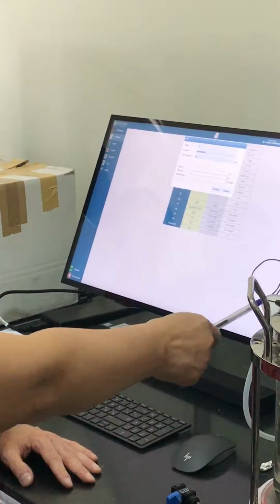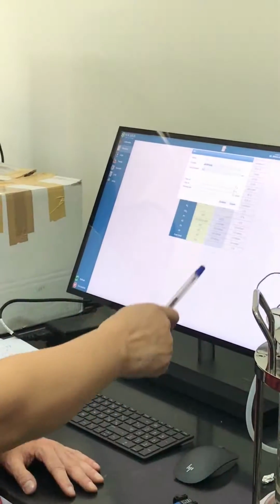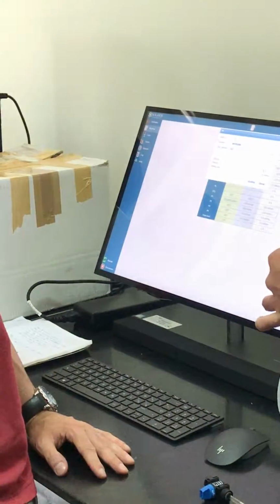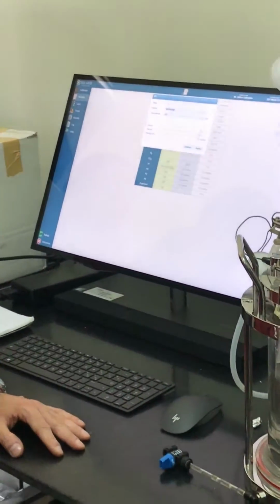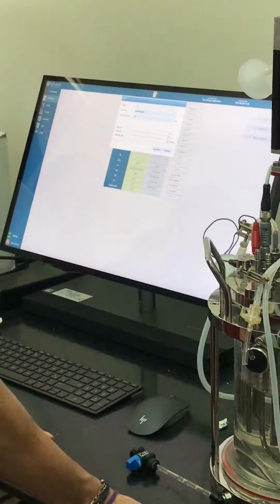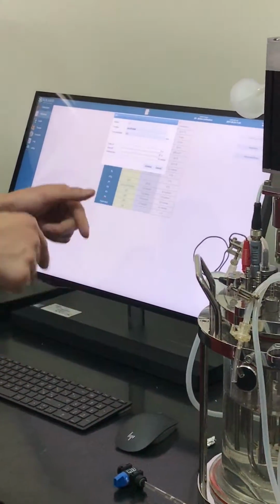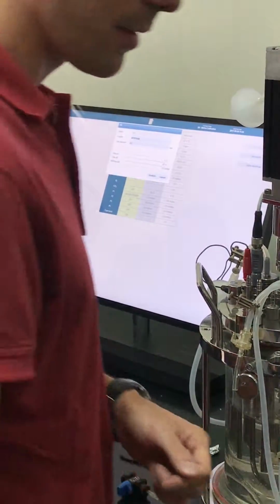Thì lúc đấy có ảnh hưởng gì việc mình có phải nhấc cái này ra cắm vào đây hay không? Cắm hai cái này vào đây tức là để đóng cái mạch này thôi. Lúc nãy cậu mới thử đoạn mạch này, để thử thôi. Okay, it's an electrical circuit. You will close the electrical circuit and start, tức là mạch đóng hay mở thôi mà.